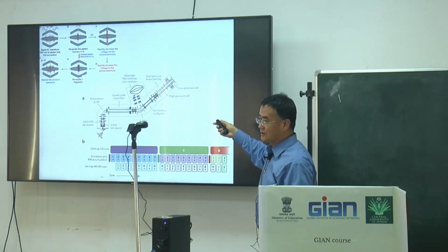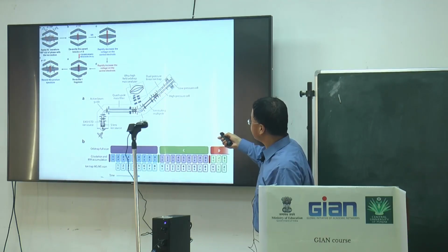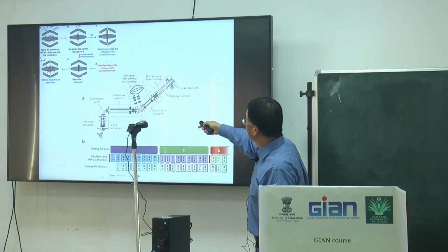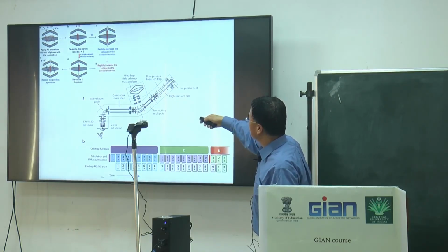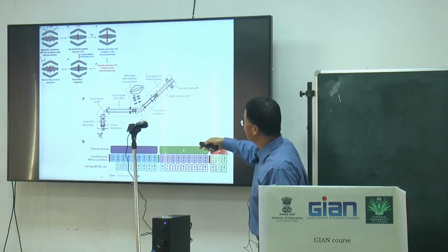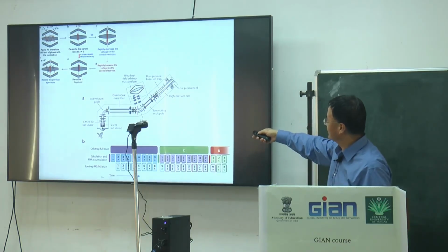Of course, we have to do selection and filtration. So from the sample, through the ultra high field Orbitrap mass analyzer, finally we also coupled with the quadrupole mass filter to get the C-trapped molecules.